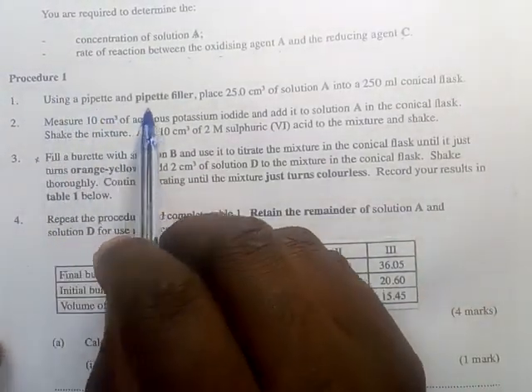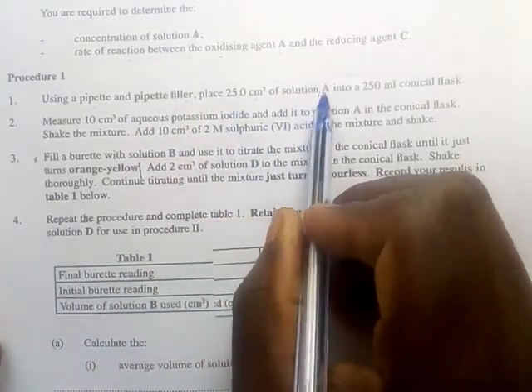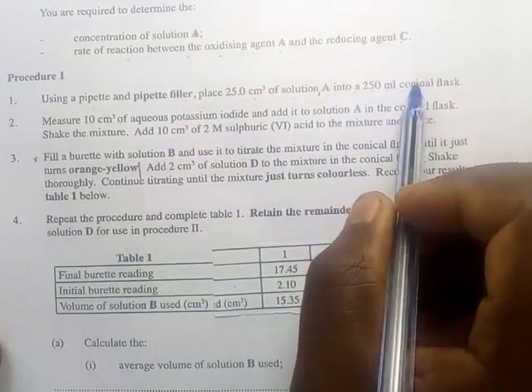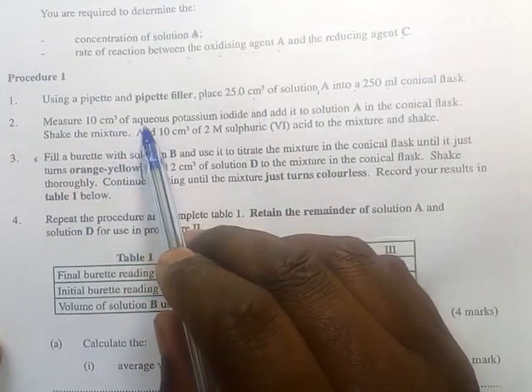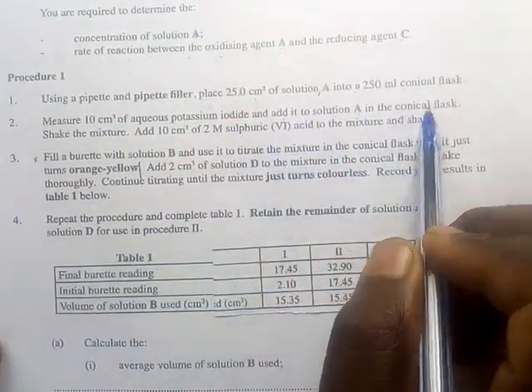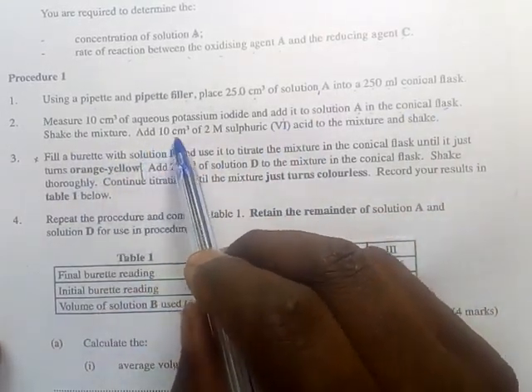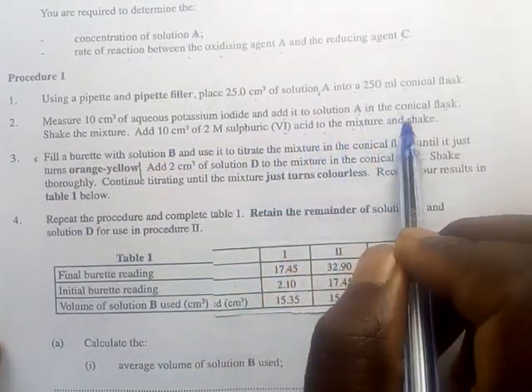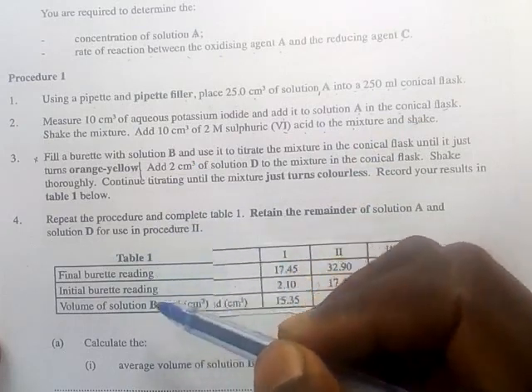Using a pipette and a pipette filler, place 25 cm³ of solution A into a 250 ml conical flask. Measure 10 cm³ of aqueous potassium iodide and add it to solution A in the conical flask. Shake the mixture. Add 10 cm³ of 2 molar sulfuric acid to the mixture and shake. As you can see, practical is following instructions.